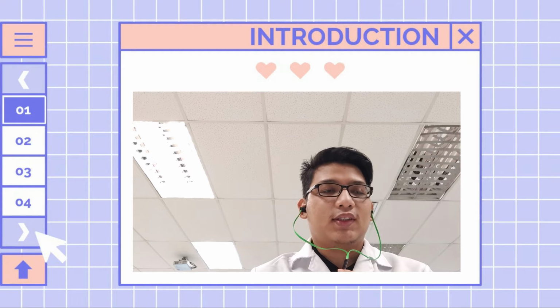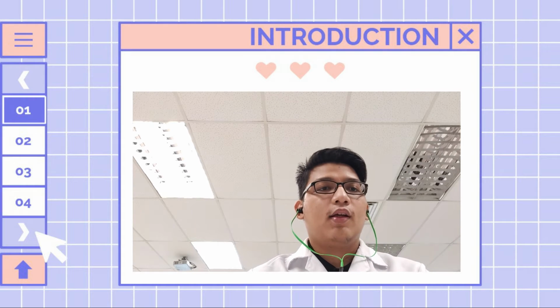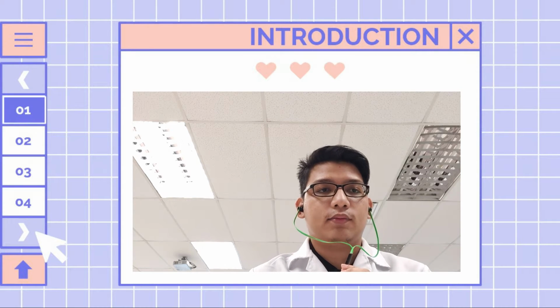Today we'll be experimenting on the topic rate of photosynthesis. Plants carry out photosynthesis to make their own food. Oxygen is released as a byproduct of photosynthesis. Light energy from the sun is absorbed by the chlorophyll and used to make sugar, which stores chemical energy.